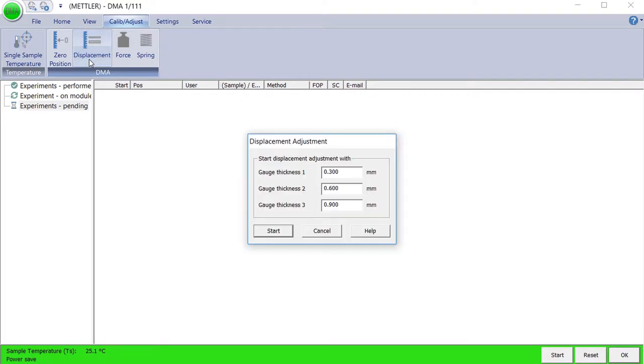A Displacement Adjustment dialog box appears. Enter the correct thickness value of each gauge block in the appropriate box. Then click Start.